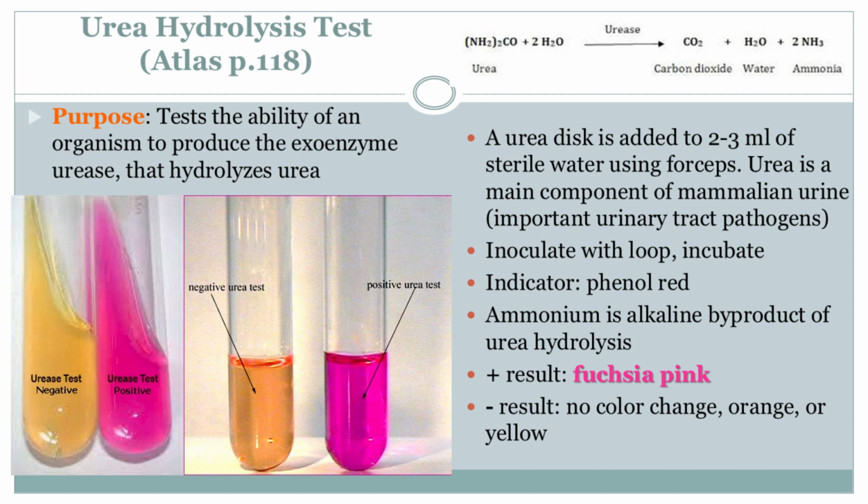That's the idea. If they're the urease-producing type, they'll break down the urea, the ammonia is released, and boom, that color change happens. And if the broth stays that same yellowish orange, then we know those bacteria aren't producing urease. No color change, no urease activity. It's pretty straightforward. So elegant. Just a simple visual cue to answer a pretty complex question. It is.